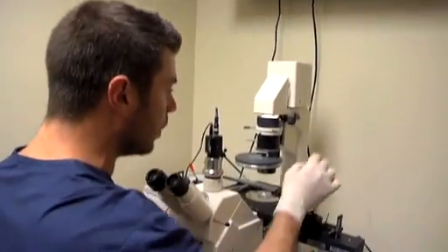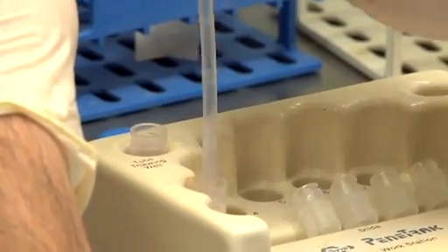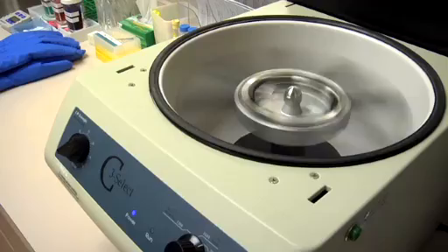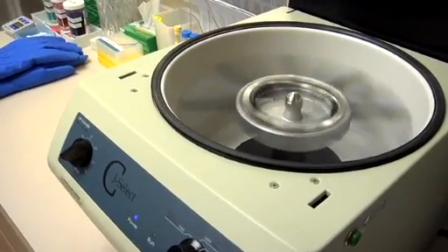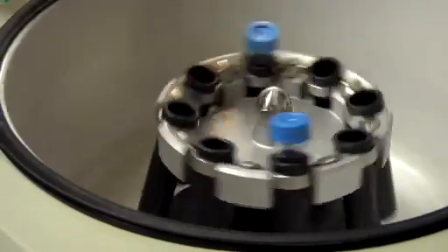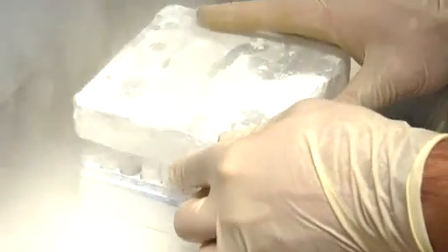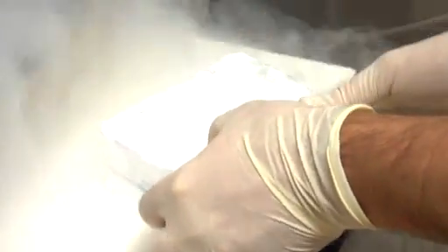Once we have the specimen, it will typically be treated in various ways to purify it and clear out any impurities. That allows us to move forward and start to freeze the specimen. We use substances that help to stabilize the specimen for the freezing process.